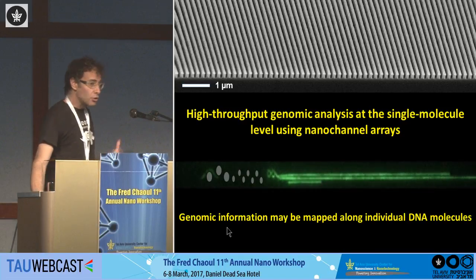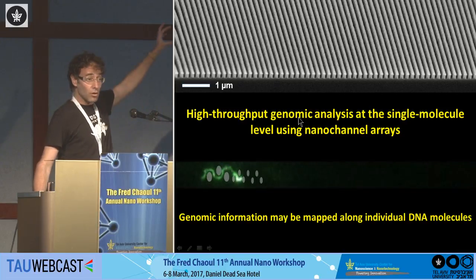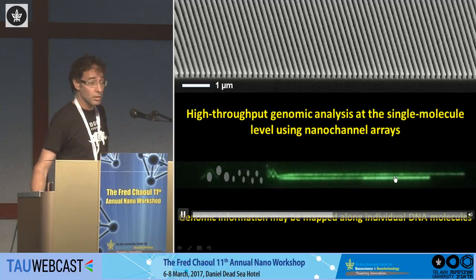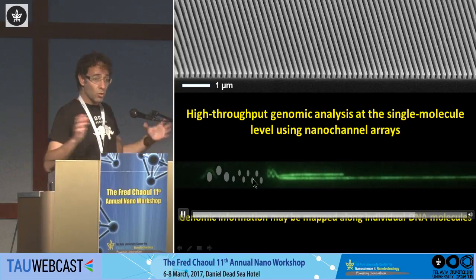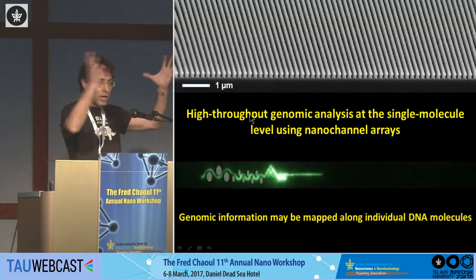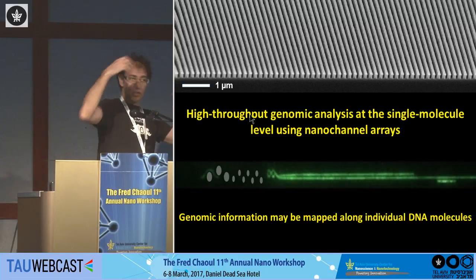And due to physical confinement, so DNA is very highly negatively charged, we can stick two electrodes at the two ends of these arrays, and DNA will be electrophoretically pulled into these arrays, and this is what we see here in the movie. This is a 400,000 base piece of DNA. We have these pillar arrays that become smaller and smaller, and this is kind of an entropy funnel, because of the entropy barrier between the random coil of the DNA that's just swimming in solution and taking a really large space. If it bounces against these pillars, it will never go in.